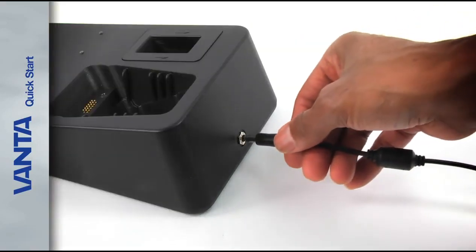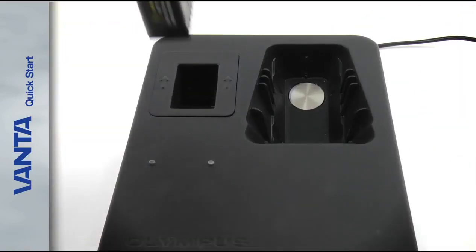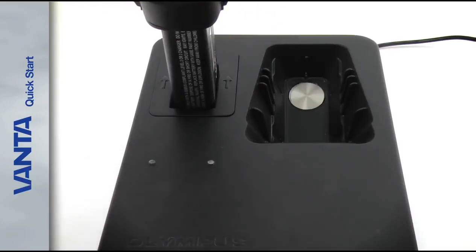To power the Vanta docking station, plug the AC adapter into the back of the docking station. Place the spare battery in the auxiliary socket.